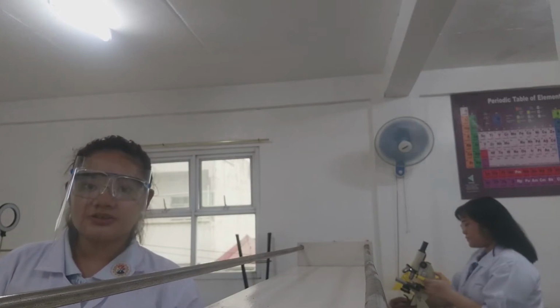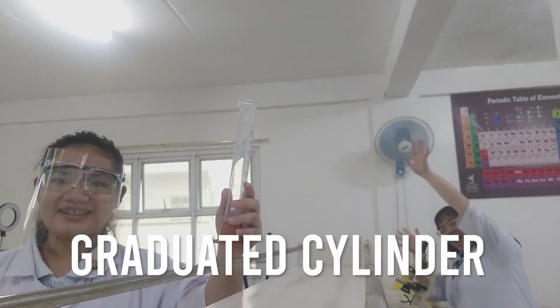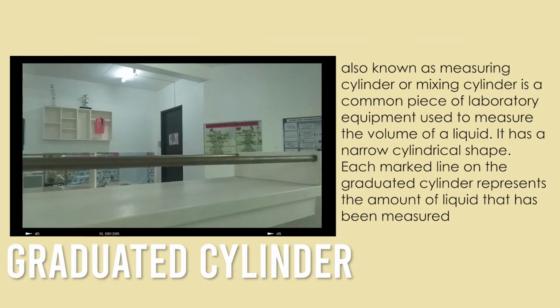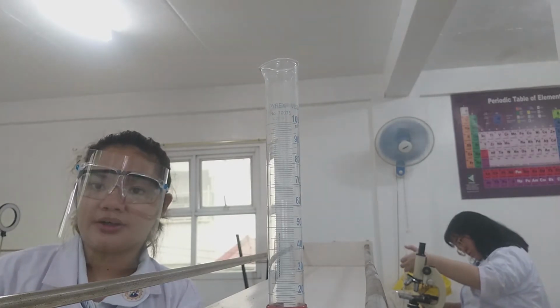And of course, one cannot do a lab equipment haul without this graduated cylinder. So this famous baby is used to measure various different volumes. And its spout lines up with the rims of other glassware for easy pouring.